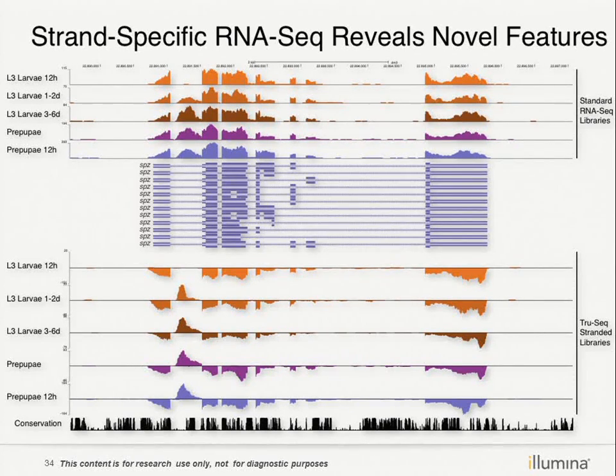These features can also benefit our research. For example, the first group used a standard RNA-seq library kit. They discovered something: there's one intron part between two exons, and they can see the expression level increase. Then they guessed it comes from the expression of the introns. But if you use a stranded library preparation kit, you can find something different.